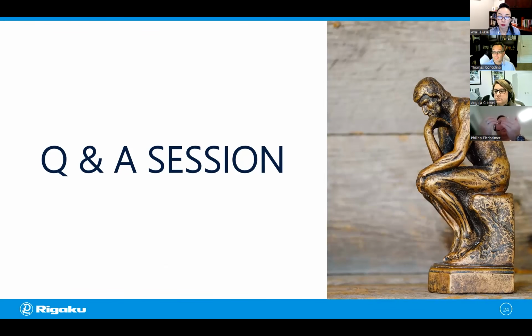And this is the good stuff with GeoDict. You get direct visual feedback. Nothing is more precise than the eye in our case. You always see what's happening, and this is the great benefit you can use in GeoDict. You always see what the parameters do, and you can check the segmentation. You can see the grayscale image and the segmented image, and you can say, okay, this is what I would expect, or this is not what I see, and then you can modify the input again, and the segmentation process can be optimized. Yeah, and even though it took either 10 minutes or 30 minutes to do a run, in the grand scheme of things, it means that you can do a lot of different experiments with those parameters in a single setting. So I really like that.